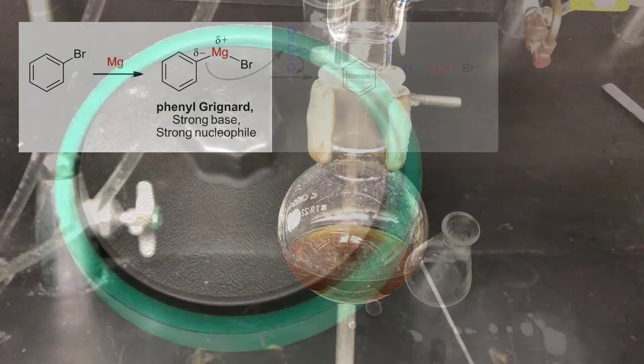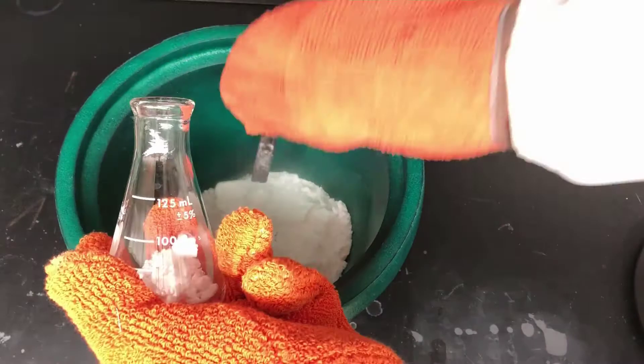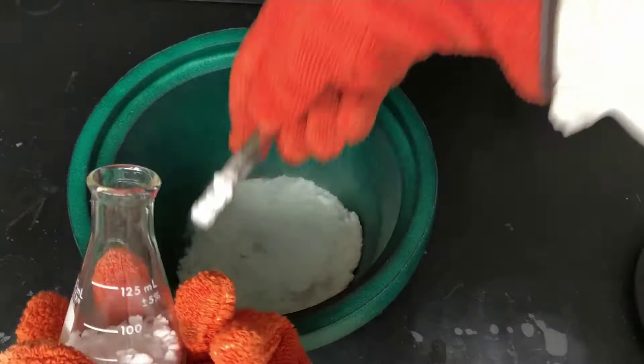This bucket contains solid CO2, or dry ice, which is very cold, so I'm wearing thermal gloves here to protect my hands. I'm taking a 125 milliliter Erlenmeyer flask and filling it about a quarter full with dry ice. Because it's cold, dry ice has a tendency to accumulate frost, so it's a good idea to dispense it just before you're going to use it.